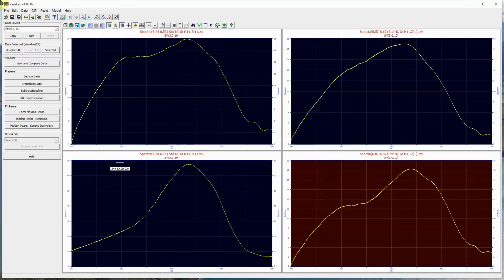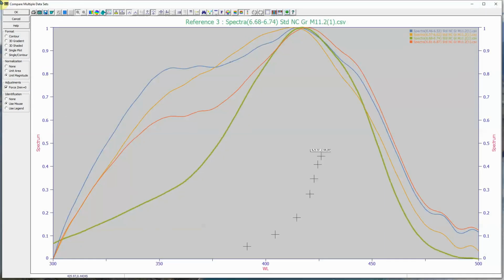And the question we would ask: are these curcuminoids? Curcuminoids are yellow compounds. They absorb in the blue, and this particular one, BDMC, has an absorbance right here, where we should be at about 415 at this value.